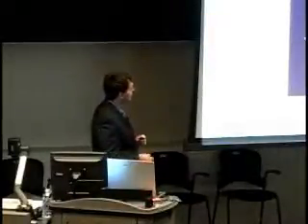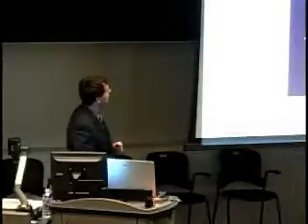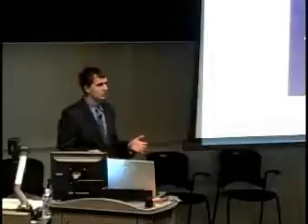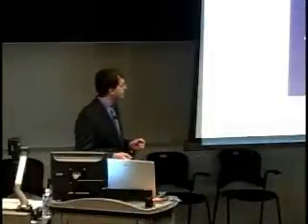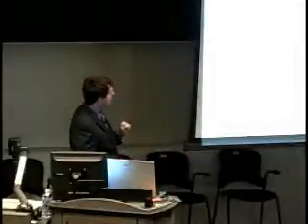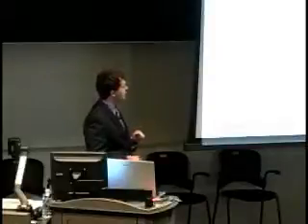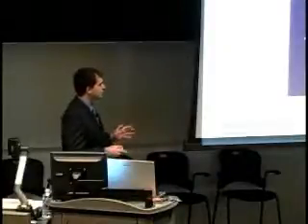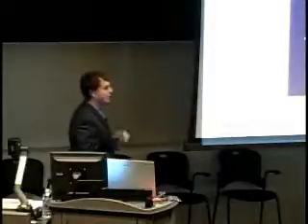The benefit from this approach is that we can look at the segmentation of a neuron as the tracking of its cross-sections as we fly through the data. Now, this is very useful because it's easily scalable to large data sets, because we don't have to run a full 3D segmentation method on the data if we just want to follow a neuron through hundreds of gigabytes.